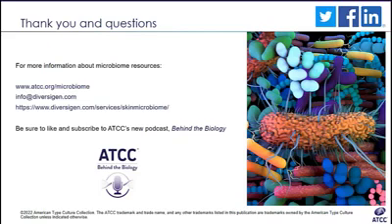Yeah, that's a good question. I would say yes, and I think I mentioned it very briefly in the webinar that dry skin sites are usually more prone to contamination risk. So again, this is why it's going to be so important to add that blank just to make sure no background or very negligible background is in your sample. But once you add that blank control and follow all the best practices for amplicon sequencing that we mentioned, you should be able to capture the endogenous skin microbiota from your skin samples.